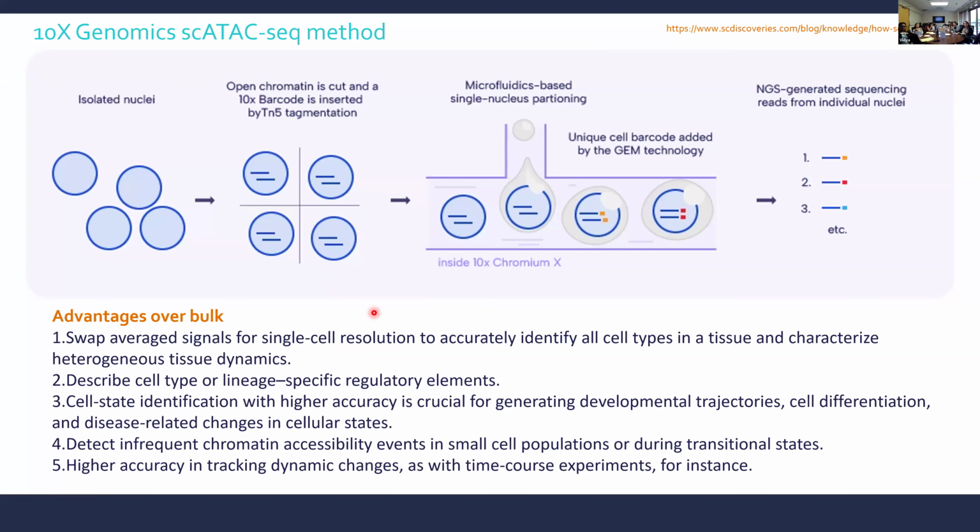And of course, just like in single-cell RNA-seq, the advantage of these single-cell methods over bulk is that instead of getting an average signal of all the cells in your sample, you're truly understanding what individual cells are doing, what their chromatin repertoire looks like, so that you can start doing things like, well, I have all these different cells. Can I identify a differentiation trajectory and see not only how the transcriptome changes as cells adopt a particular cell fate, but what regulatory elements are important for those transitions over time. And, yeah, so you can do that kind of thing.